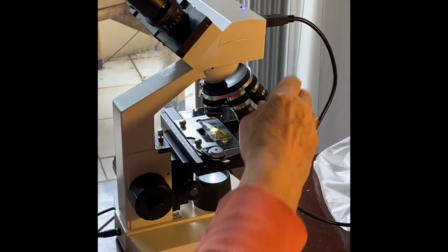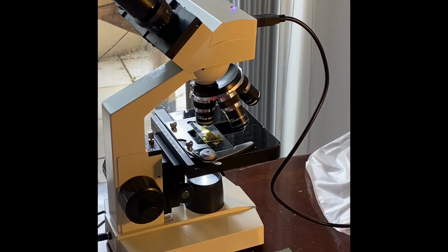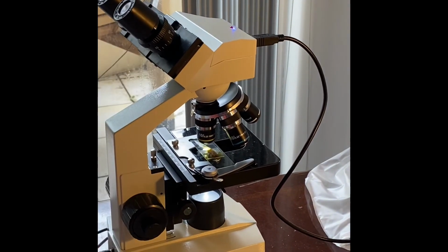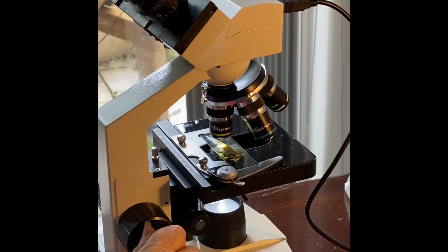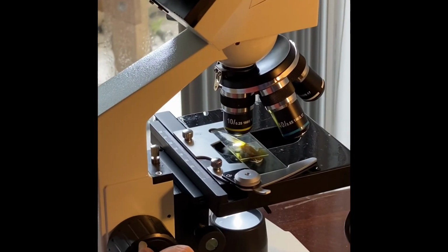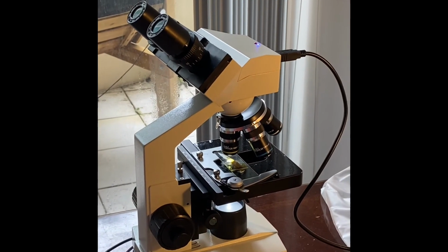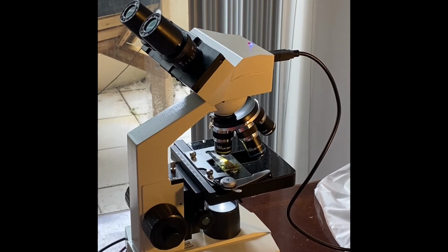And then switch to 10x, or 10 times 10, which is 100x total magnification, and do your fine adjustment. You just have to turn it very little. And there you have your drawing that you will make.